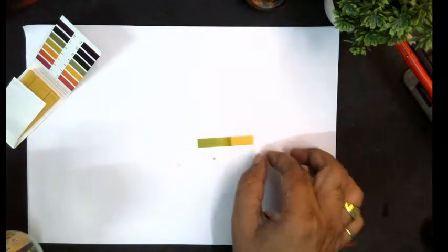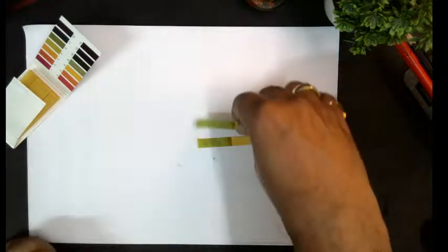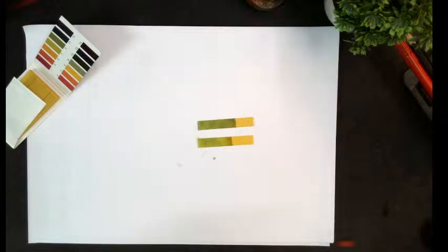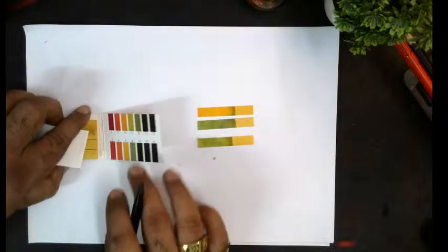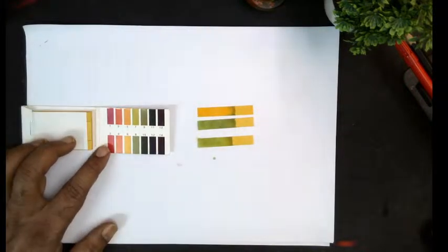So this is pH 8. This is pH 7 and this is pH 6. Now we have the strip here. This is the pH reference indicator. Let me focus further.